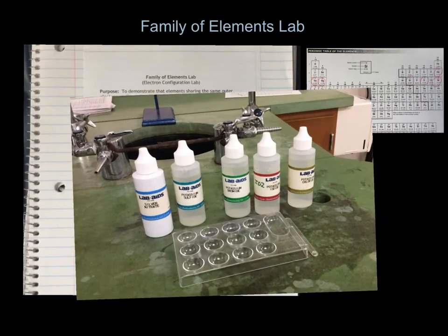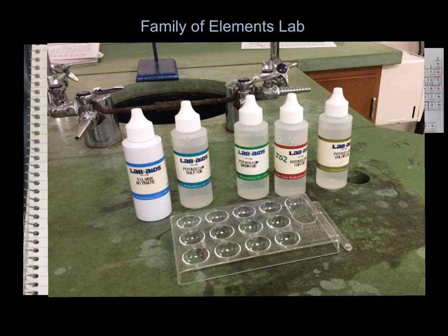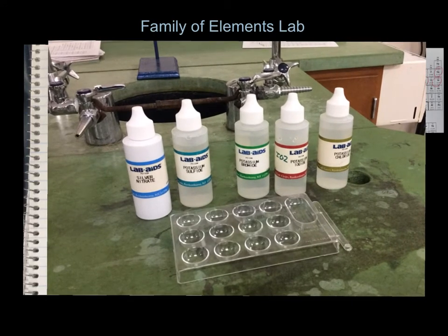So these are the materials that we had at our stations. This is our well plate. Right here, it is a plate with wells in it that we could put samples into. These are the solutions of our materials. This is silver nitrate. This, in this different colored bottle, is what will be reacted with everything else. We see potassium sulfide, potassium bromide, potassium iodide, potassium chloride. These are solutions of these elements.